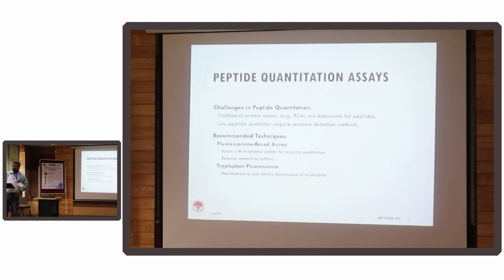Now you won't use a cuvette because you did not purify that much peptide. Most SPE columns that we use in our labs get us around 20 to 25 micrograms of peptides, and you don't want to lose it, because that peptide will be run on a mass spec. If you're planning to do some discovery proteomics, once you are done with the discovery, you would again want to use that peptide for some targeted studies. So you don't throw the peptides away just like that. Extractions are usually for one sample type; you do it once and take maybe 2 aliquots and keep them in the fridge.